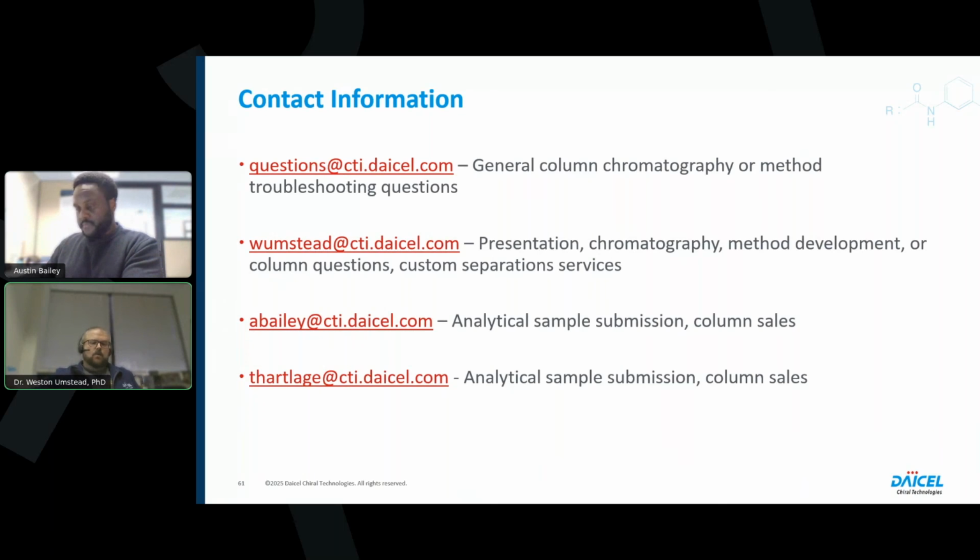I can't say that I've worked with this method directly to be able to say for sure that you should be able to detect or quantify 5 micrograms per mil of epinephrine. I could say for sure that if you had the ability to check mass spec, you would definitely be able to do that. But UV based, I unfortunately can't give you a direct experiential answer.